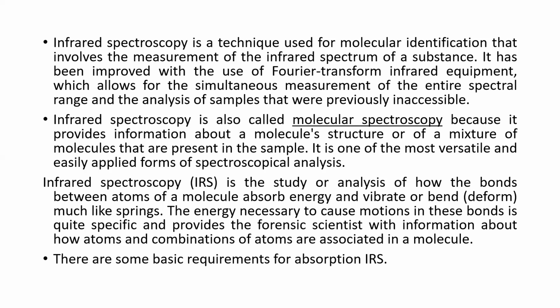And this energy is going to be important to cause motion in these bonds, which is going to be specific because it is going to be determined by the atoms present in the type of bond, the arrangement of those atoms within a molecule, bond angle, and so on. So detailed insight about the structure of a molecule can be obtained by exposing your sample to IR and spectroscopic measurements based on that.